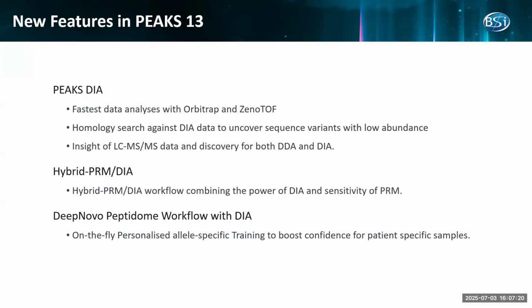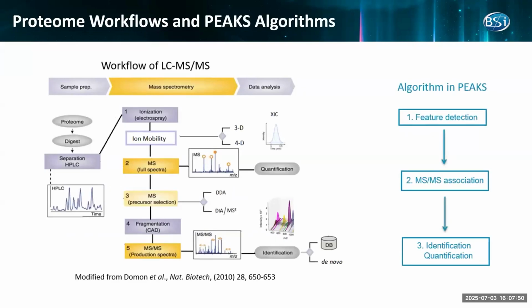Surely we will continue to improve discovery and targeted proteomics. And considering the dark proteome, or peptidome, is getting more and more attention, we continue to enhance our peptidome workflow. The peptide is the main focus; protein or other information is used as the source the peptide comes from.